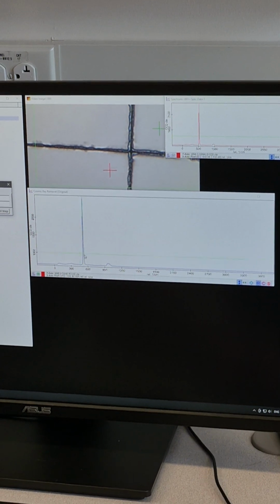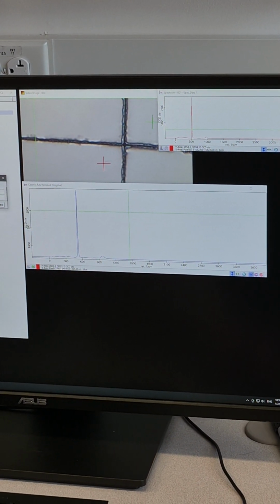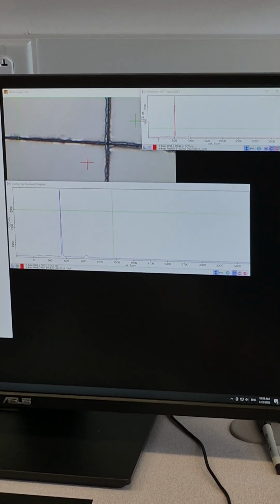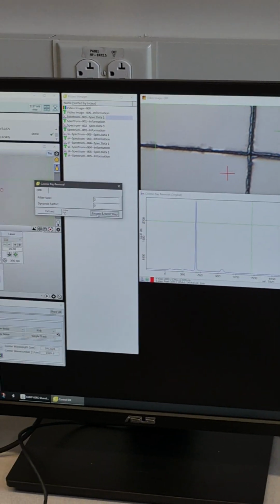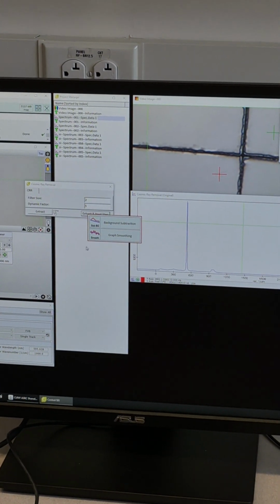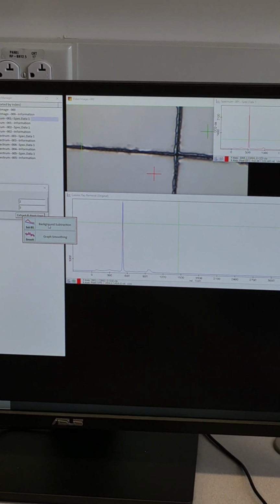Which means extract the red spectrum and save it here as a single one. It's a processed one. We already did so, but we have a next step. So I just do the extract. The next step is I want to remove the background. So, background subtraction.